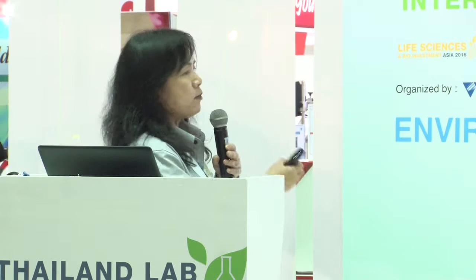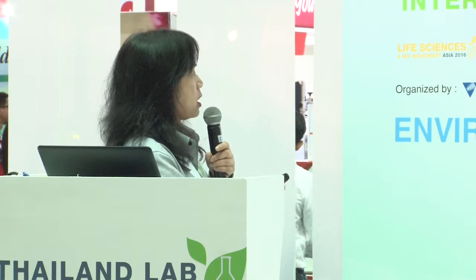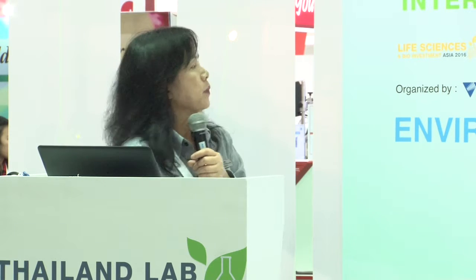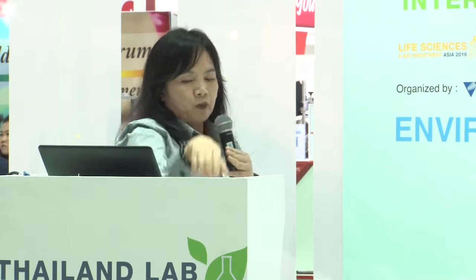Okay, so after that we need to count how many ions, we need to know the sensitivity. To count the ions, we have a DDEM, discrete dynode electron multiplier. And it's 10 orders, meaning only digital, and we can give you 10 orders of magnitude.